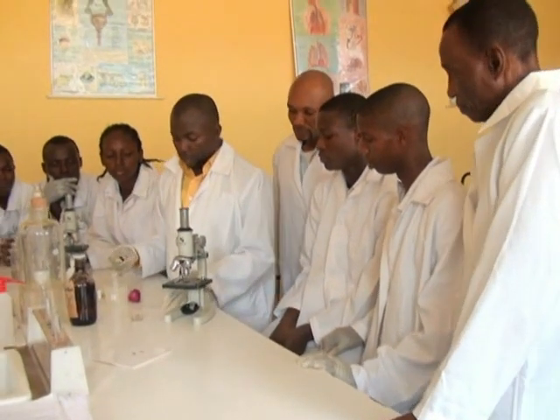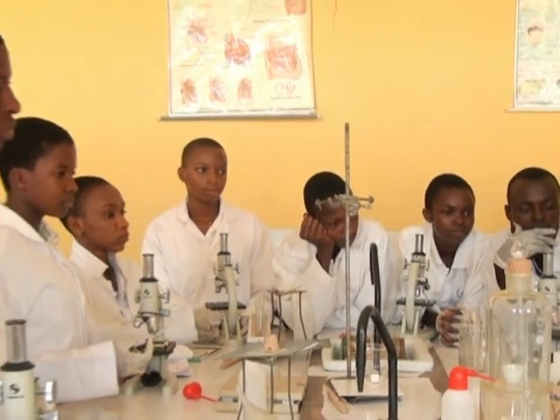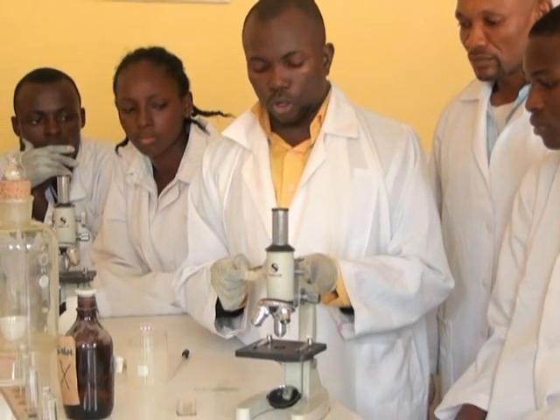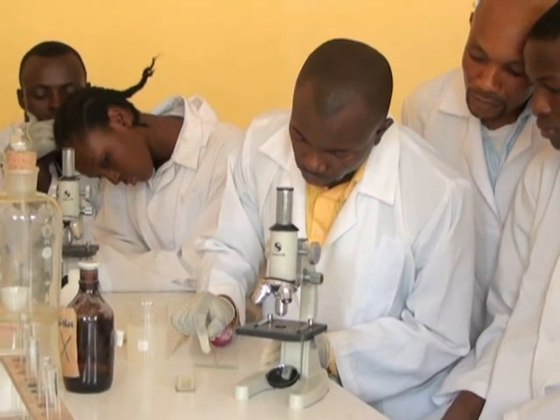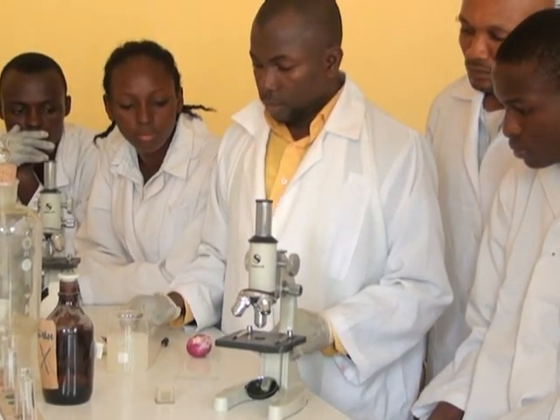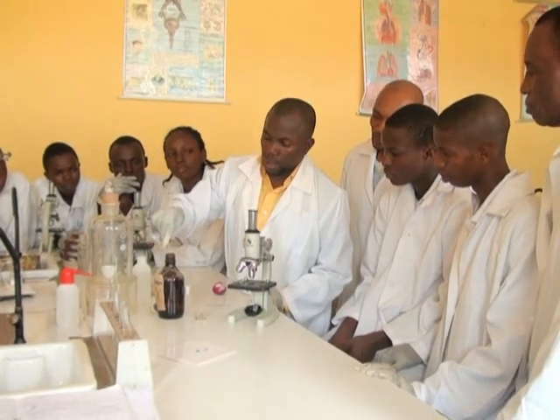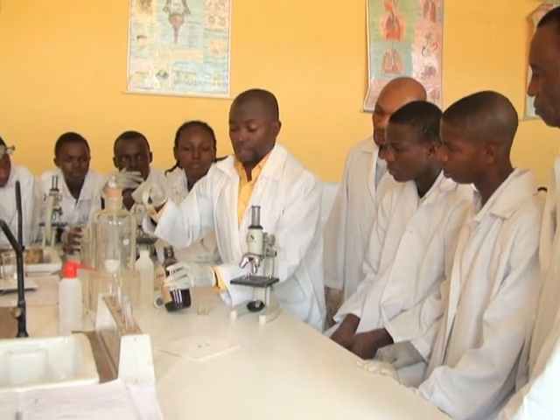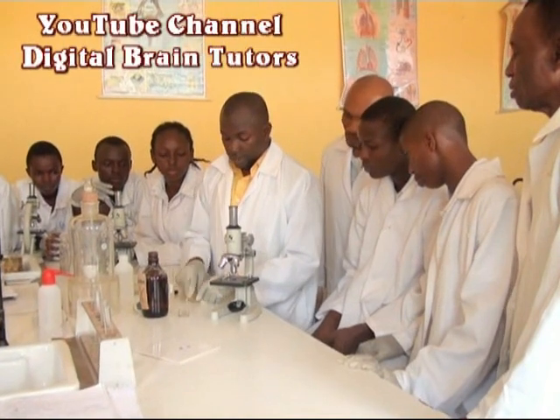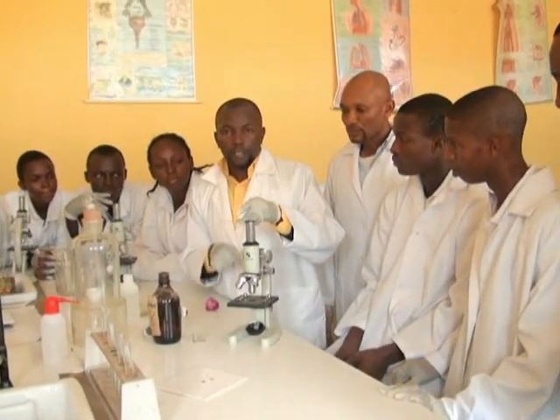This is a glass slide. Then we use the tweezer and peel the skin of this onion. Peel the outer skin, remove it. Then we now peel a small piece of onion skin and introduce it into the water droplet on the glass slide. Then we put a drop of iodine stain on the specimen. So this is the onion tissue cell, introducing water and the stain with iodine solution.